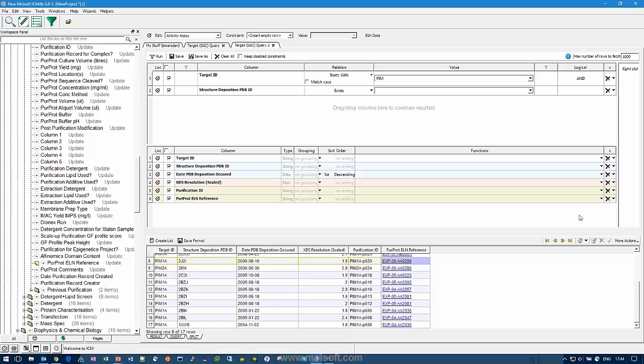This is, I guess, important. If the database is normally managed by a second tool, is there a danger of issues arising from overwriting data or formatting differences? Yes, of course there is. There always are. But one of the things that we have tried to think about here is the issue of locking. When something is happening to the database, it locks that row or that table, depending on what sort of database it is and how it's set up, so that something else can't go and clobber it. Now, Scarab is very careful to make sure it uses appropriate locking at the right times to do that.